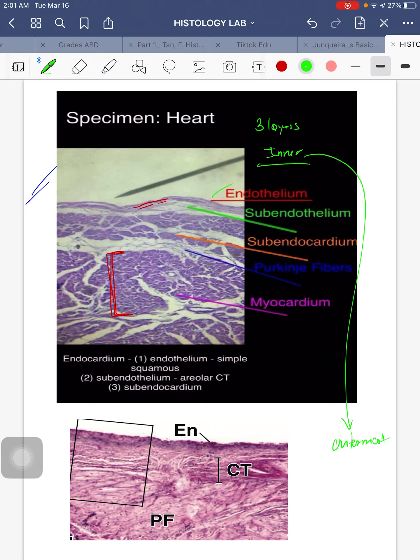First we'll tackle the endothelium. Endothelium is lined by simple squamous epithelium — it's part of your endocardium. Below the endothelium — that's why it's called 'sub' — is your subendothelium layer. And if we go lower into that area, you will see the layer now known as your subendocardium layer.